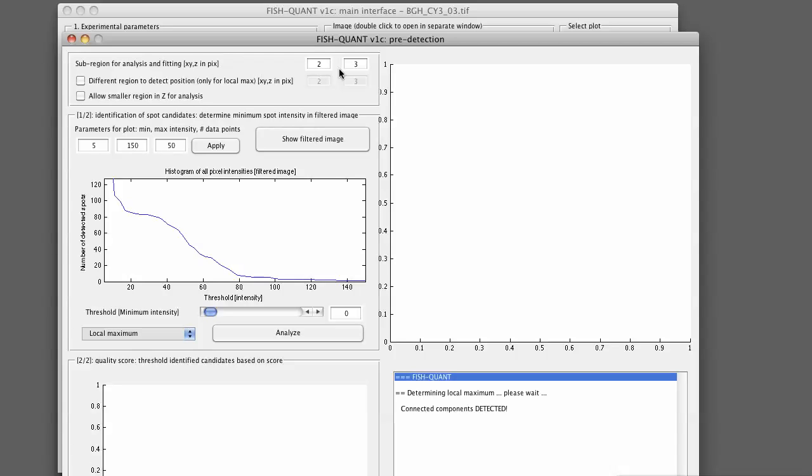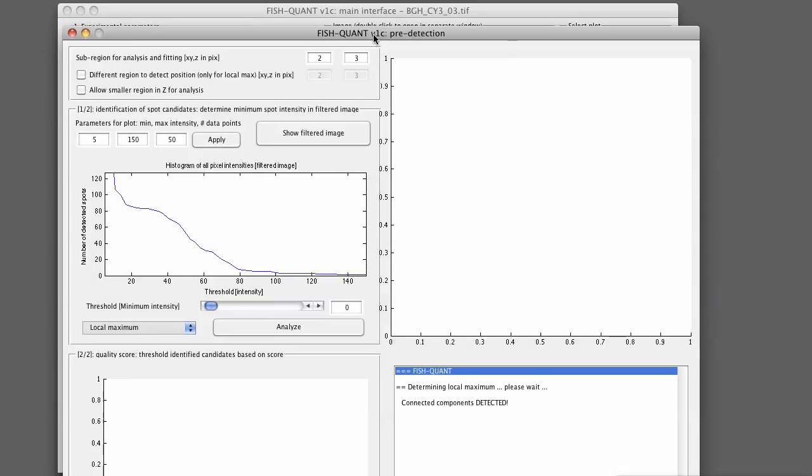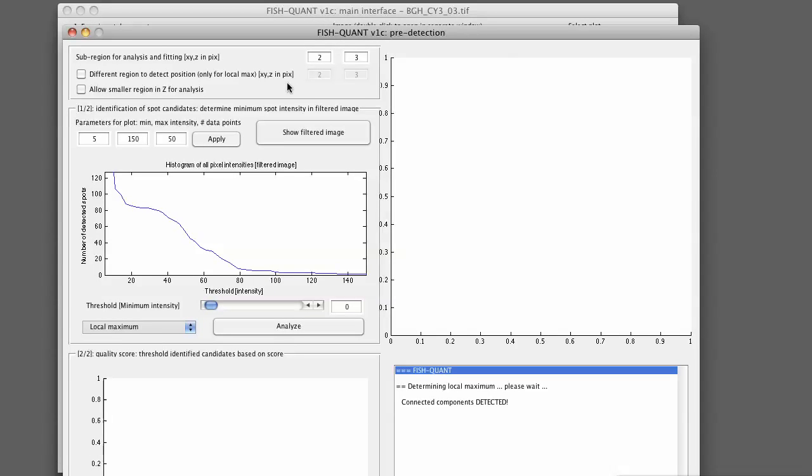Up here you define the size of a sub-region around each of the pre-detected spots that will be considered. It will be considered for the calculation of a quality score to judge the quality of this spot. Then also later, if you want to fit it with a 3D Gaussian, this is the size of the region around each spot that will be cropped and used as an input for the 3D Gaussian.